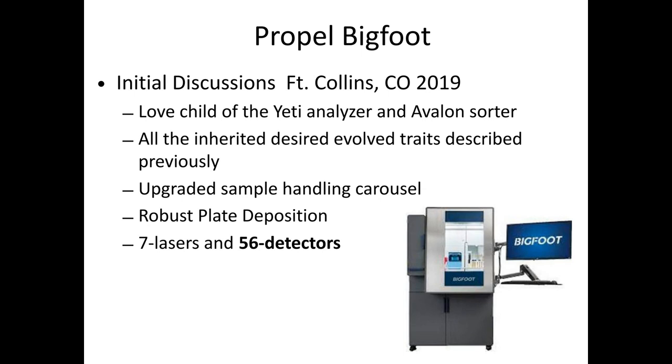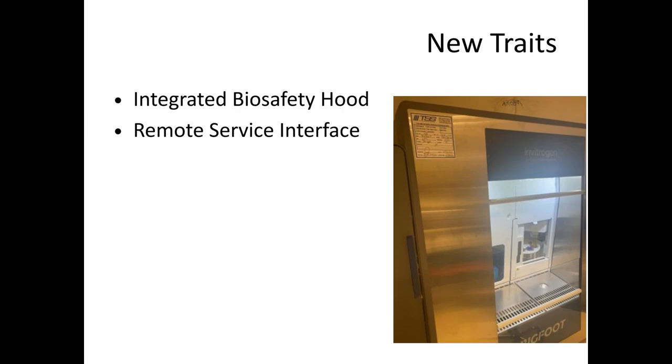And it had 7 lasers and 56 detectors. And right away, when I saw that last one, 56 detectors, I'm like, wow, that kind of jangled something in my head that I'll get to in a second. But more than that, there were 2 new features I hadn't seen before that I now realize should be key going forward. One was the integrated biosafety hood. I'd never seen that before.